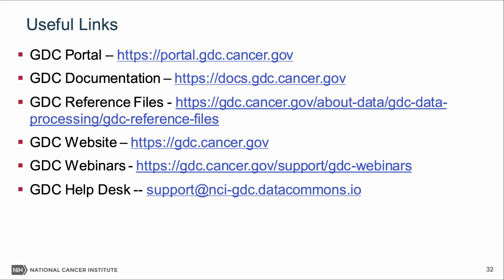So the whole genome is what we have talked about. For the whole exome, we currently don't have a plan to call the ASCAT algorithm on the whole exome data. Whether we will do it in future, we don't have a plan yet. But just to let you know, what we have been observing in recent years is that whole genome is gradually becoming the dominant data type. We have more and more whole genome data submitted to the GDC than whole exome, year over year.